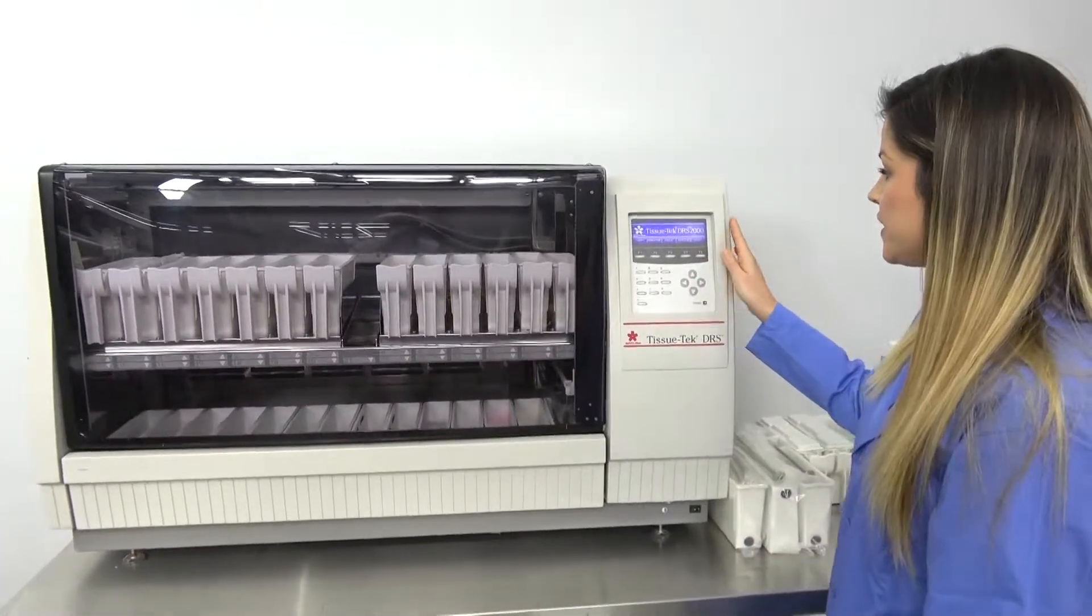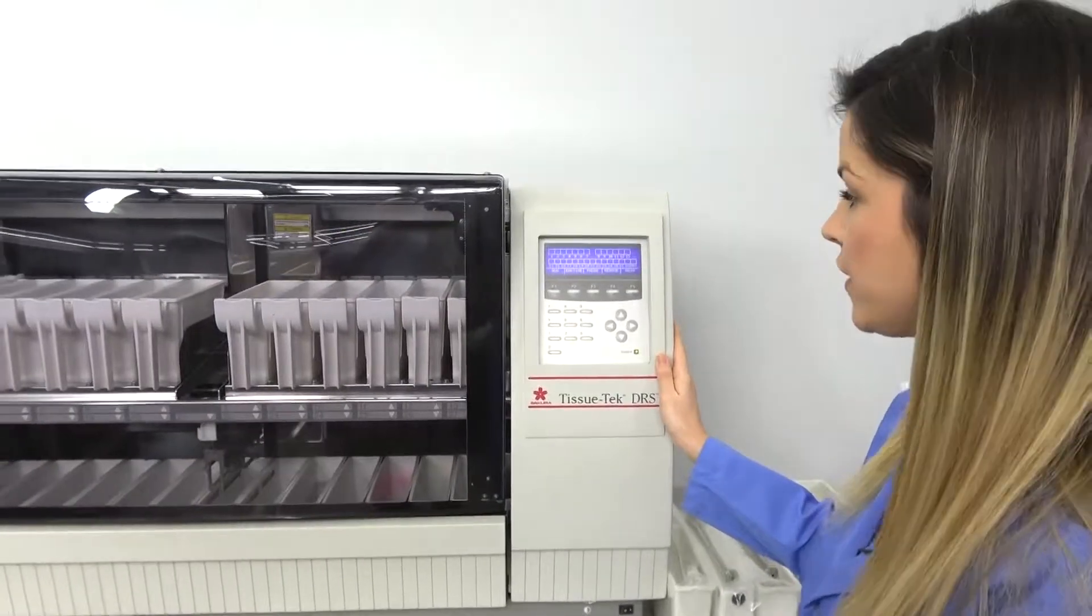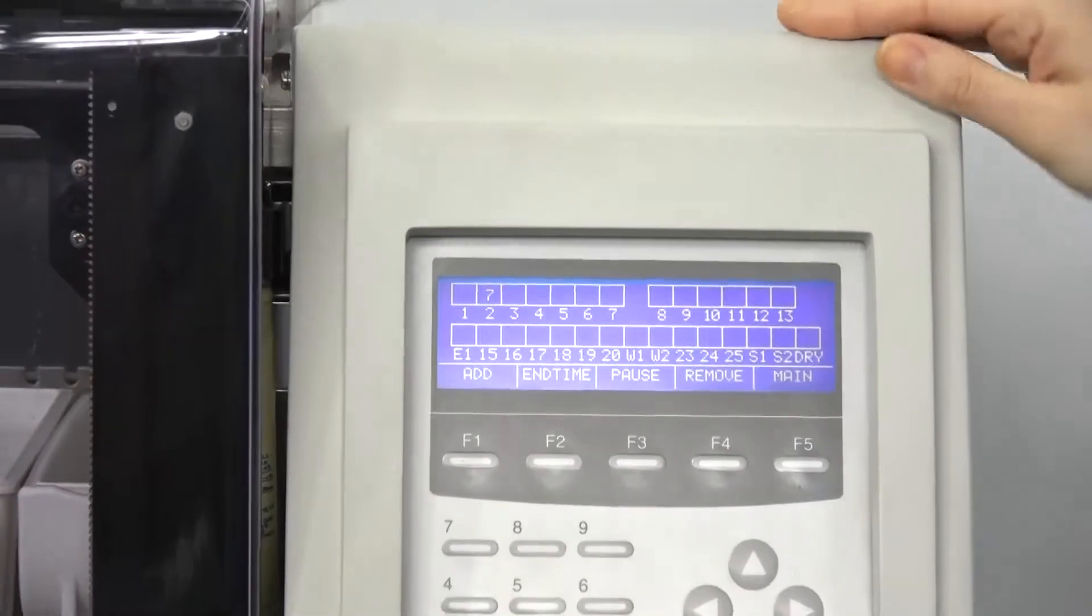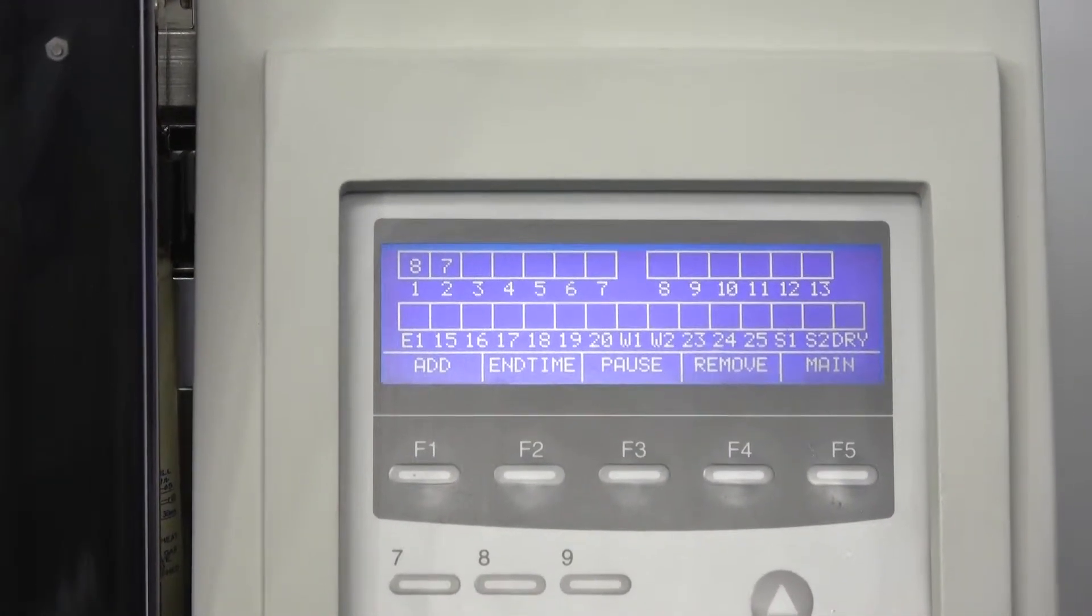Within the menu here it is a very nice feature that you can monitor the run that you're currently on. So right now you can see that the first run is located here in bucket two. And now it has just put the second run in location one.